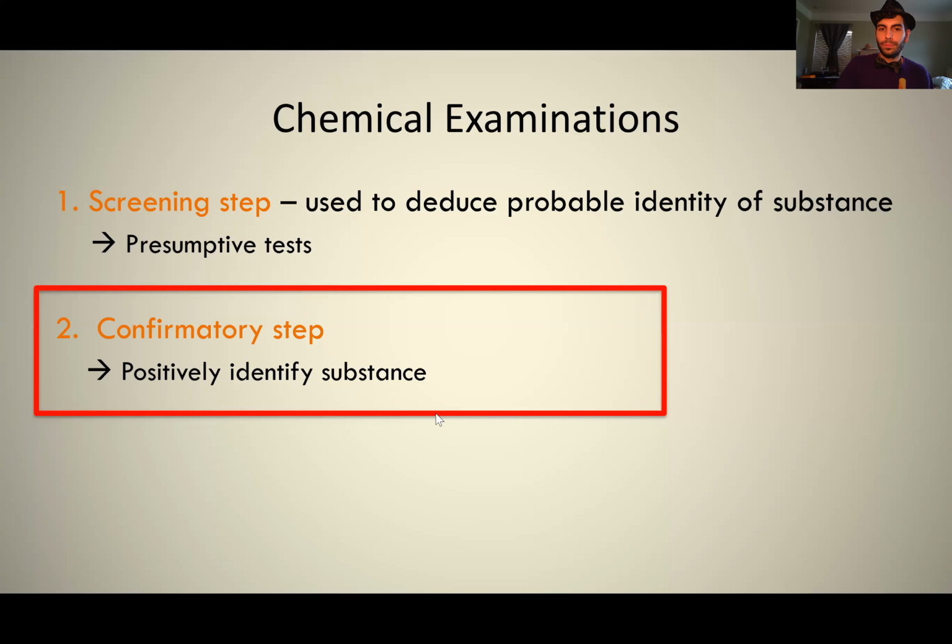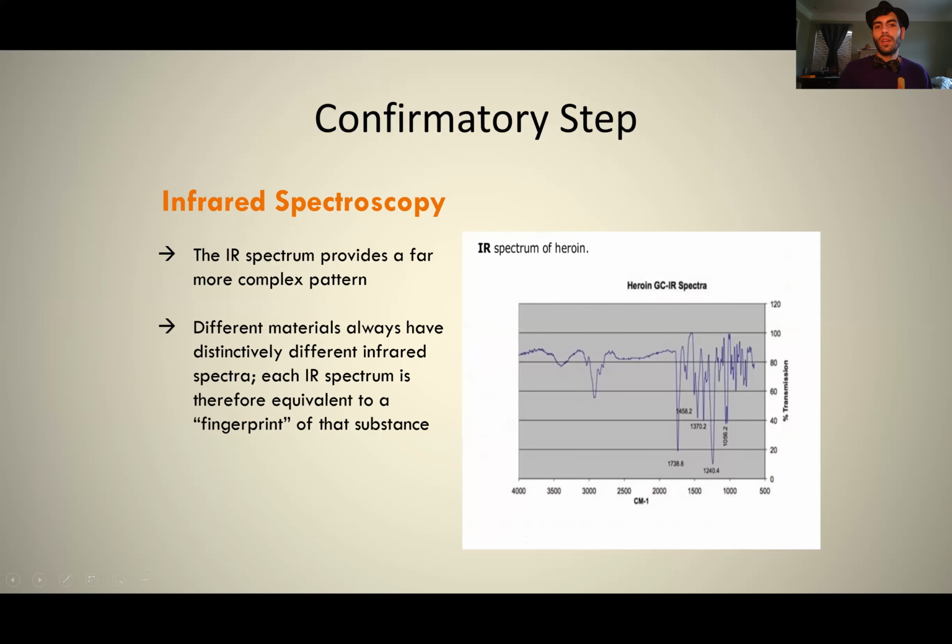So when using FTIR, the big caveat, the big thing that's super important, is that it has to be a pure substance, because if it's not a pure substance, then I cannot identify that drug. Unfortunately, it's not entirely useless, but I cannot confirm anything using that instrumental technique.